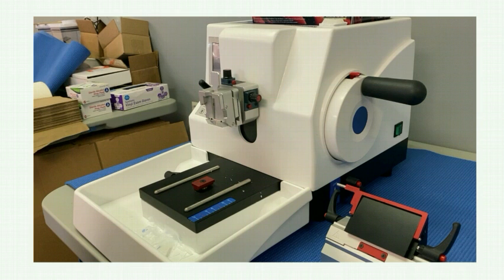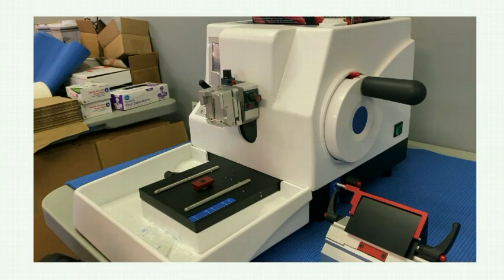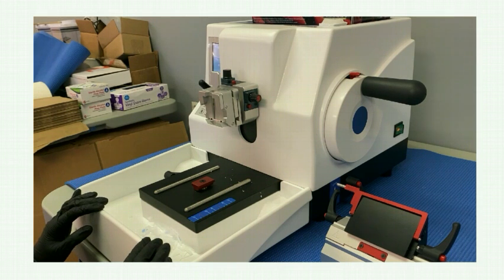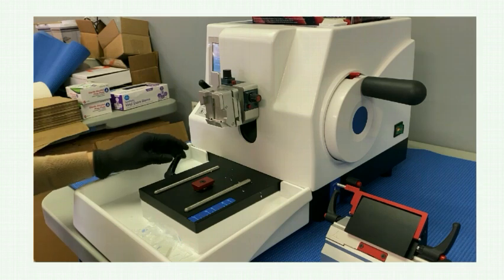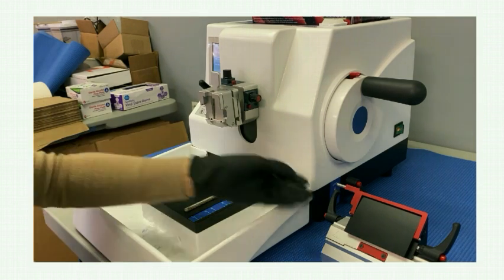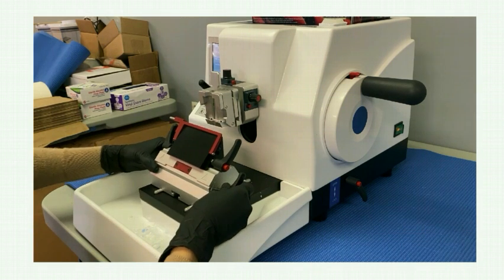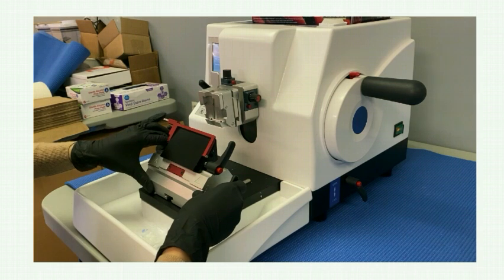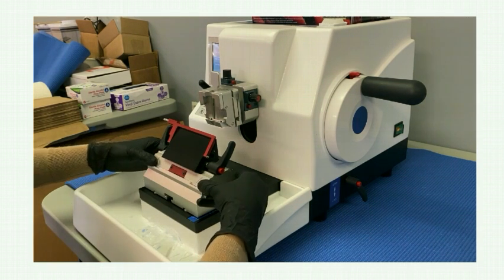Now let's put everything we've reviewed together in this short video. In this video, I am turning the microtome on and you'll hear a beep. Then I am loading the knife block onto the microtome base and securing it in place. I can turn the levers on both sides of the knife block to adjust the cutting angle and the horizontal movement of the cutting stage.